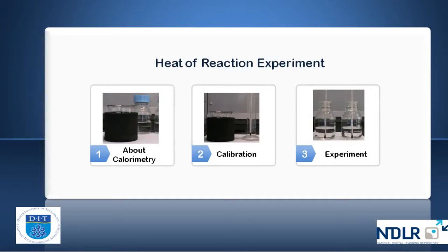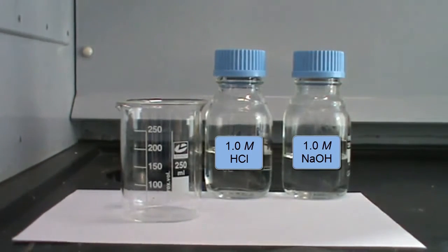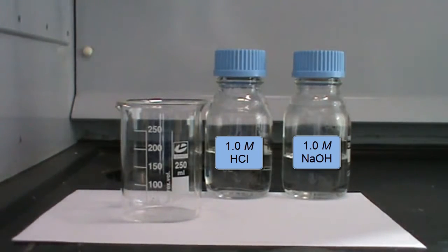In this video we're going to look at the heat of reaction experiment. In the heat of reaction experiment we're going to mix two substances, in this case an acid and a base. I'm going to measure the heat of reaction that's given off on mixture.